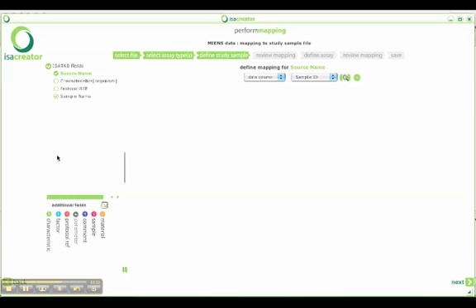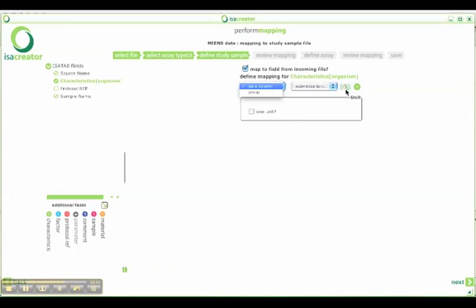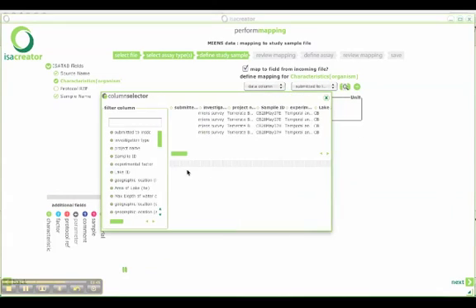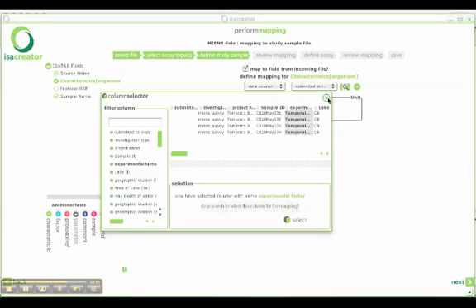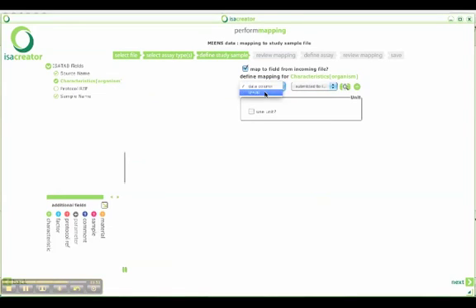Then we could add a characteristic field. We need to provide taxonomic information, which is cast under organism information. And here, because there is nothing that is specifying what it is in the incoming file, the MIxS recommendation is to select metagenome, which is accepted by the ENA and SRA repository.